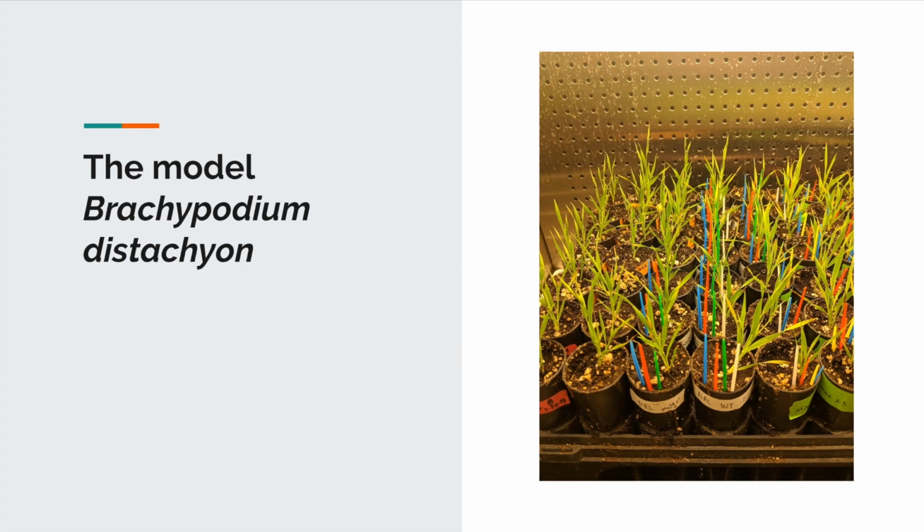And there's a variety of reasons why we use Brachypodium. First of all, that's what we were provided. But Brachypodium boasts short germination times. It grows quickly in the lab. It's fairly easy to work with. All of our plants are able to germinate successfully and grow.